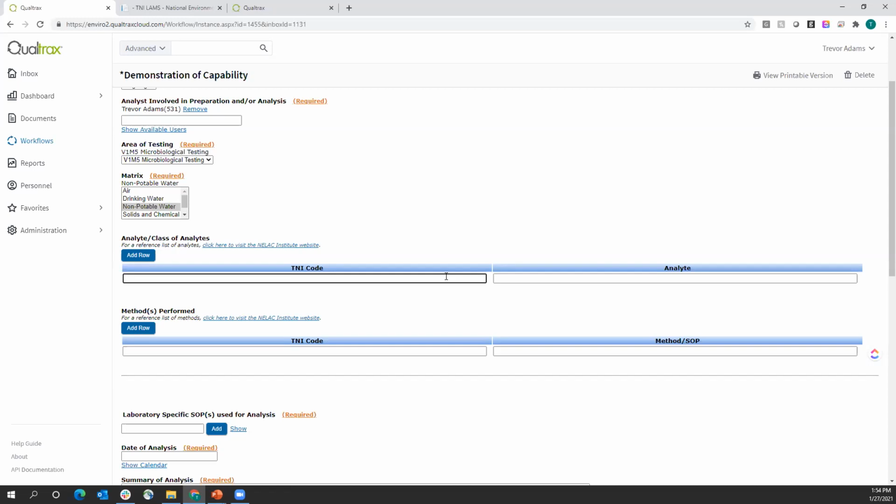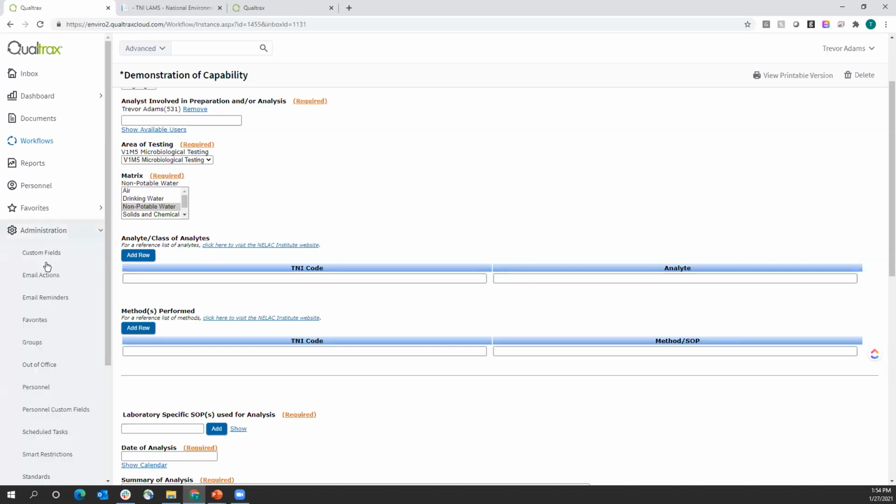Nick is a customer of ours, so he knows that we always prefer drop downs for most of these because it helps with reporting. So what we would recommend, especially for you guys, is probably switching these out to list drop downs, and then it would just be creating the custom field with your list values in there. That would then be specific to yours.